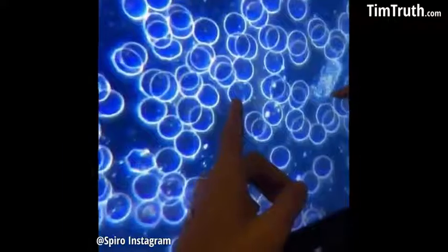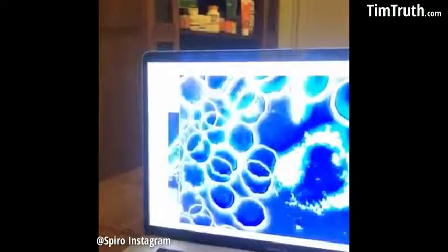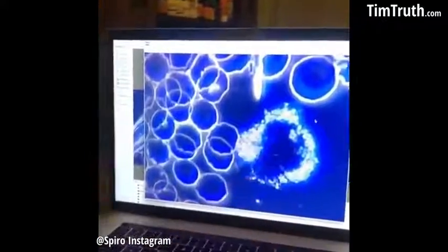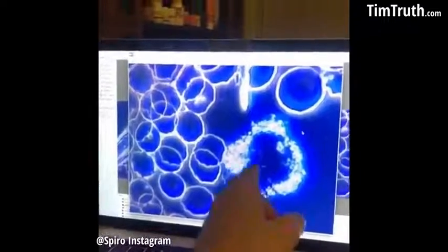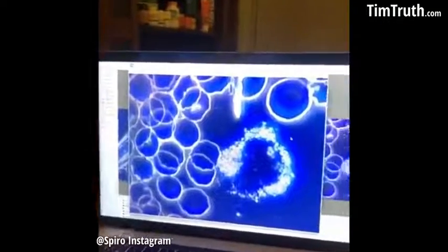Let's look at this live. This is what blood cells are supposed to look like. A white blood cell, you see the activity. And the membrane is the way it's supposed to be, right? If you could see, it's perfectly circular. This is the visual reference on how good blood cells should be. Here we're seeing a totally corrupted cellular membrane. And this here is, Dr. Peggy? A white blood cell, but it's destroyed. This is a white blood cell that has been totally destroyed in a vaxxed person.